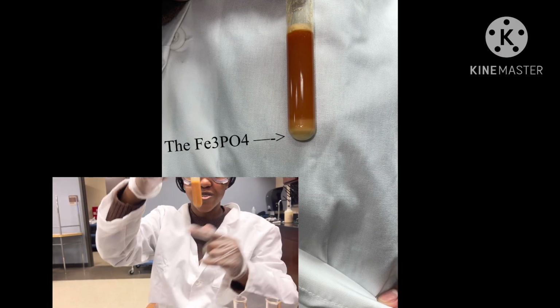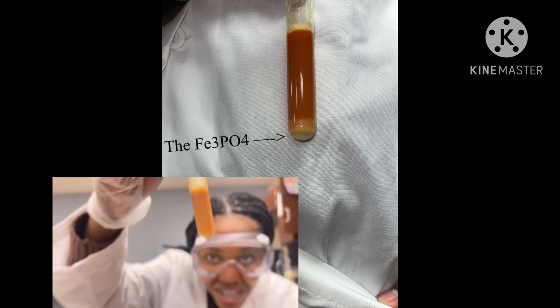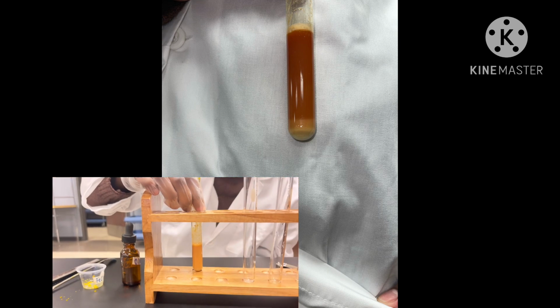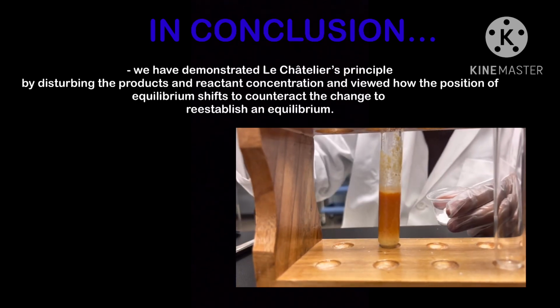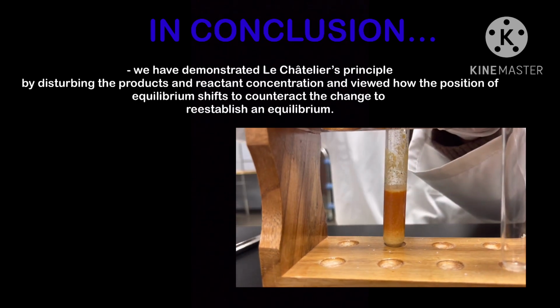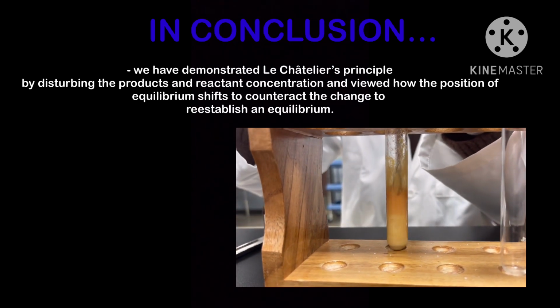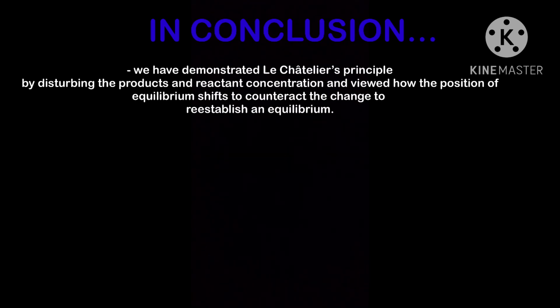At the bottom of the test tube is the iron 3 phosphate, which precipitated out from adding sodium phosphate and being insoluble in the solution. In conclusion, we have demonstrated Le Chatelier's principle by disturbing the products and reactants concentration and viewed how the position of the equilibrium shifts to counteract the change to reestablish an equilibrium.